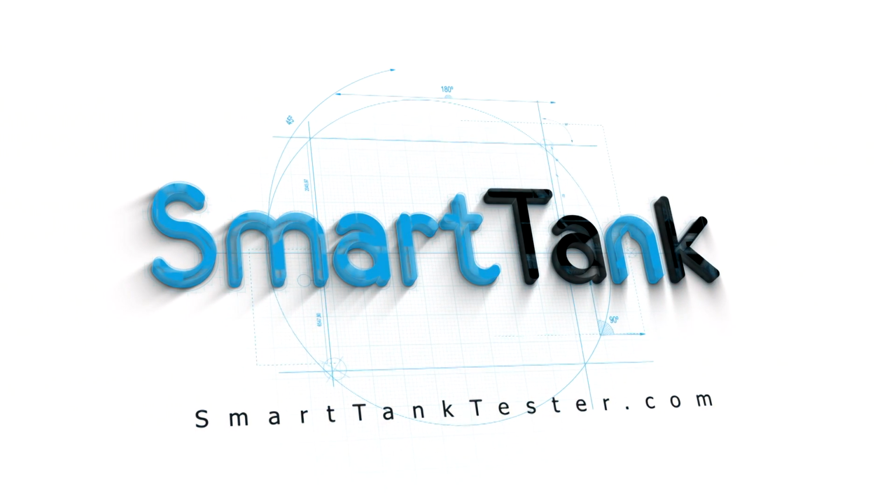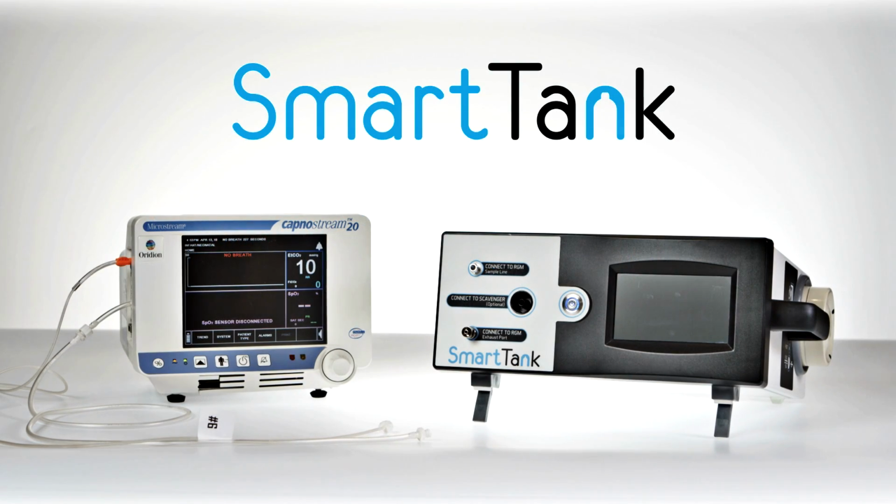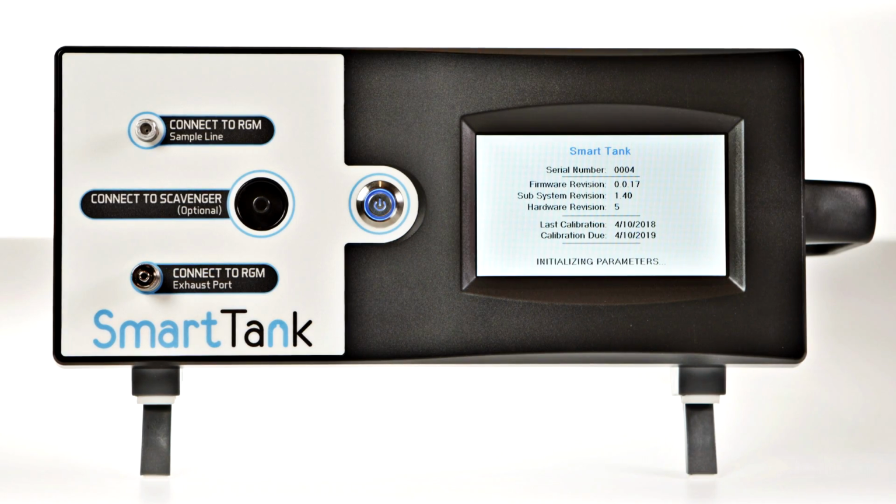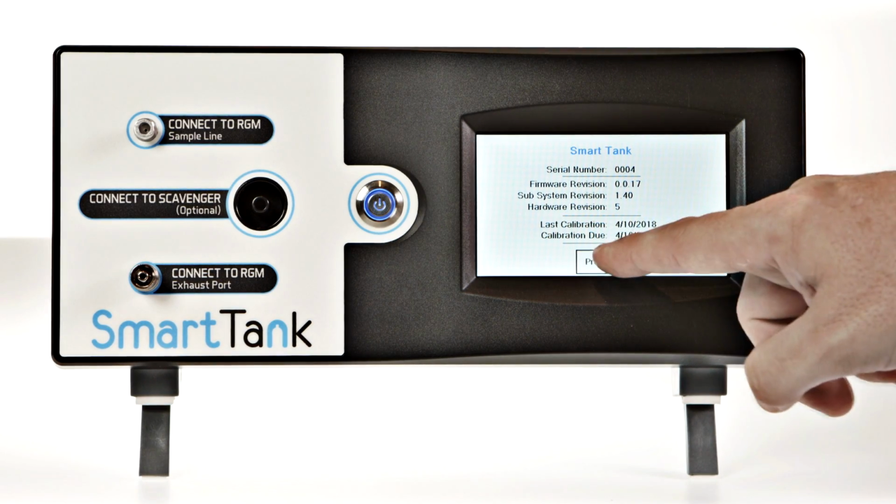Testing a gas monitor with the SmartTank is easy. Here's how it works. First, turn on the SmartTank. After a brief self-check, the SmartTank is ready to go.